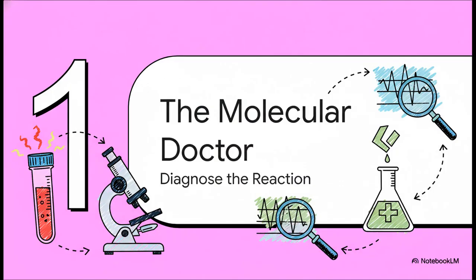So here's the mindset I want you to adopt. I want you to think of yourself as a molecular doctor. That little PCR tube, that's your patient. It's showing symptoms, and you need to run the right tests, look at the results, and then prescribe the correct cure. It's all about a systematic, diagnostic approach.